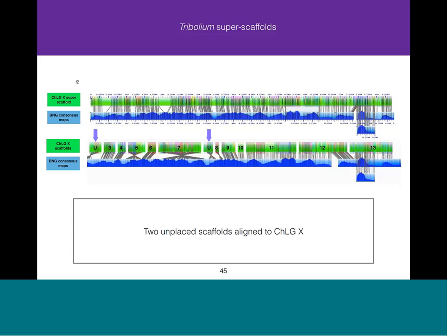And the next question is, since assembly scaffolds have ends, how much flexibility do you allow during alignment of in silico assembly map with BioNano Genomics map? So the BioNano aligner is unaware of whether something is an end-based gap or sequence data. It just looks to the BioNano aligner like a region that doesn't have a label.